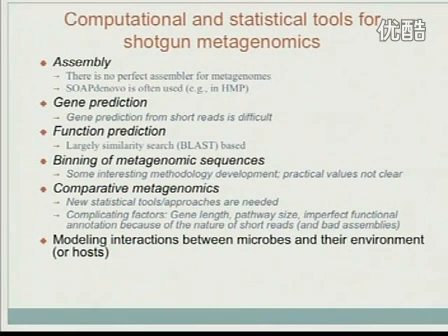Because we had the RNA sequencing lecture last time, and there the comparison was that SOAPdenovo is by far the worst assembler for de novo assembly of RNA sequencing. But for transcriptomics, that's a different story. For metagenomics, it's essentially trying to assemble genomes, so it should not be that different from, for example, assembling an E. coli genome. But the complexity is higher.